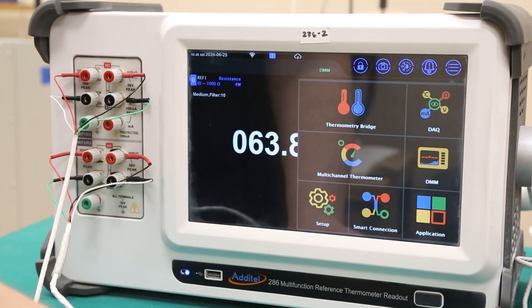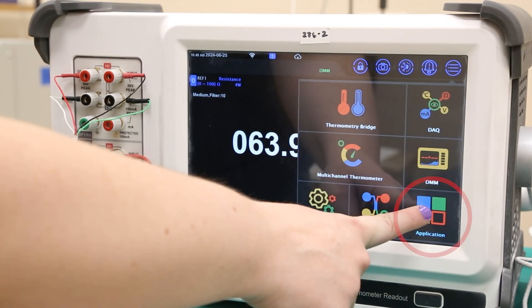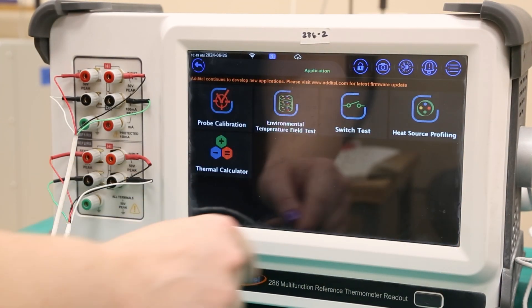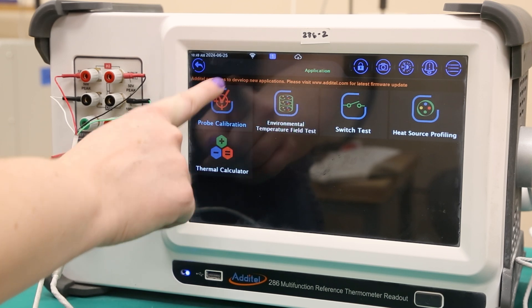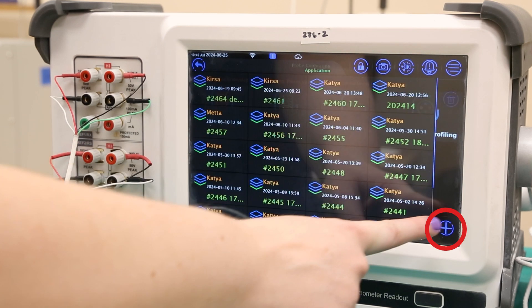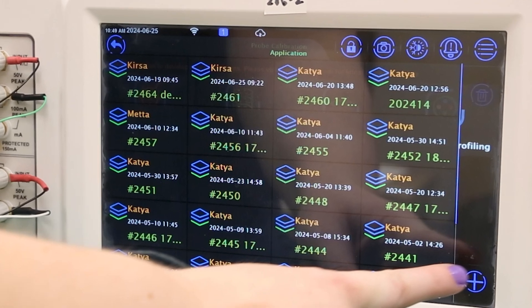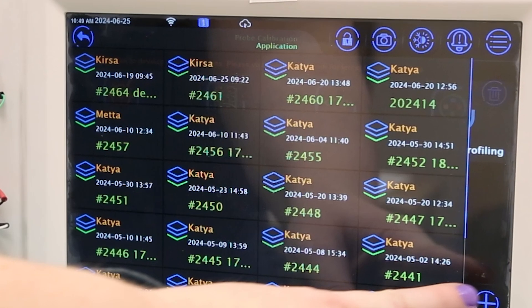Now to set up the calibration test. From the 286 menu screen, select the application button, then probe calibration. Select the plus icon in the bottom right corner to add a new test. These tests are saved to the device and can be revisited at any point in the future.